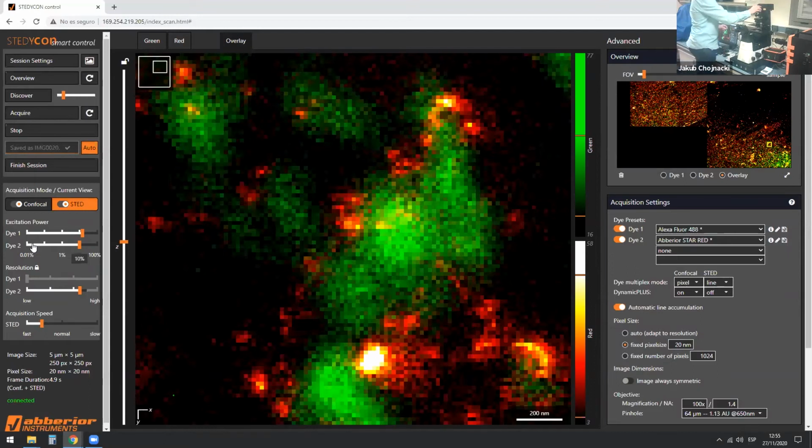With SARS-CoV-2, I looked at that sample a little bit before. And I think, unfortunately, it's a little bit less well labeled, but I think we should still see enough virus particles to get some results out of it.